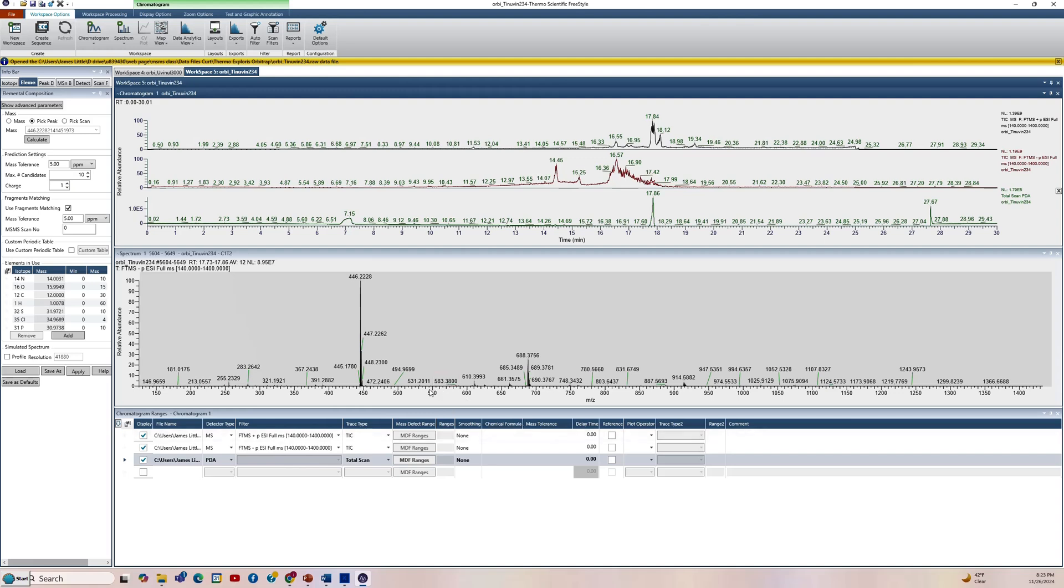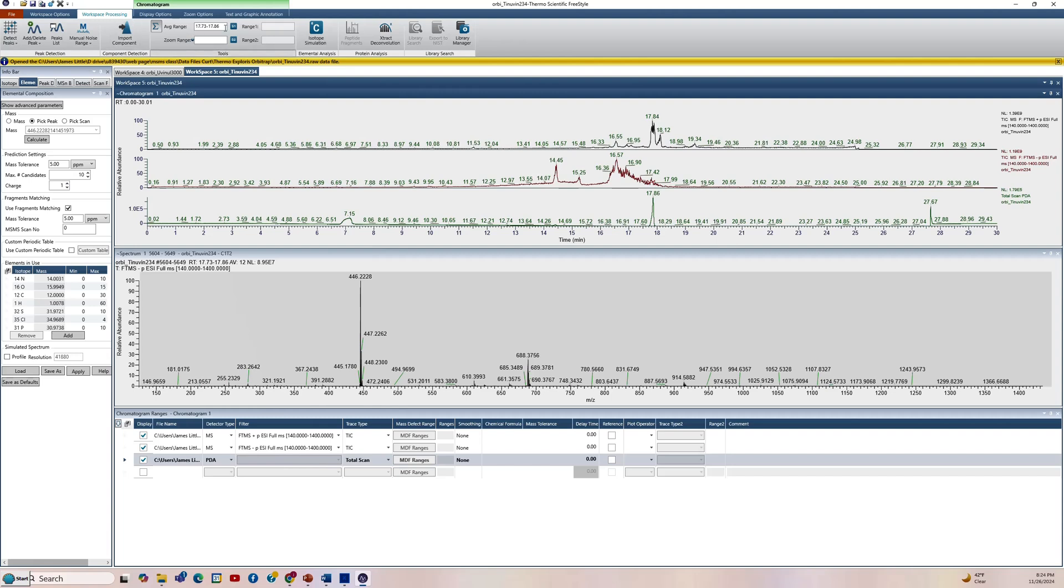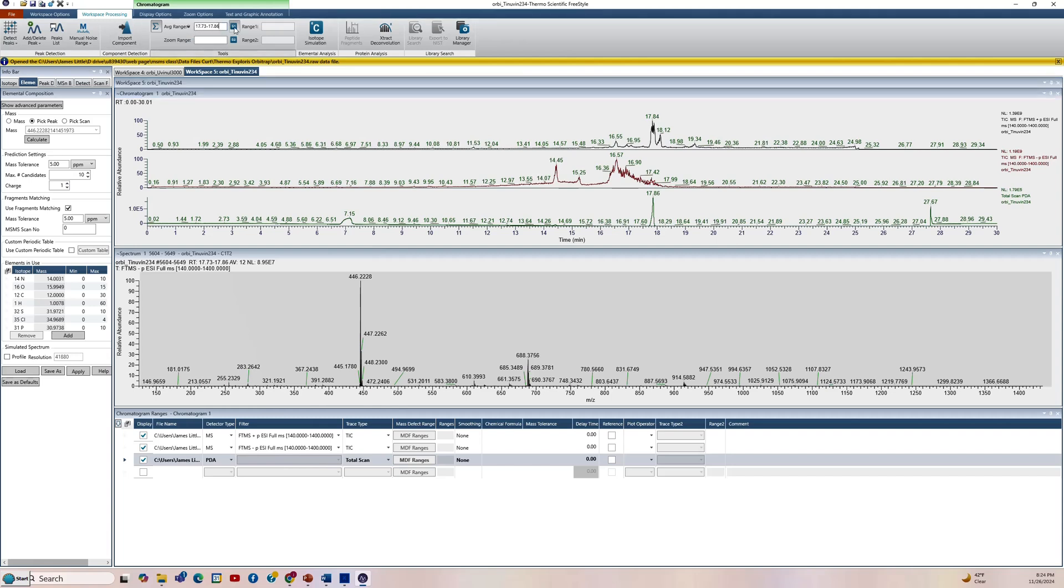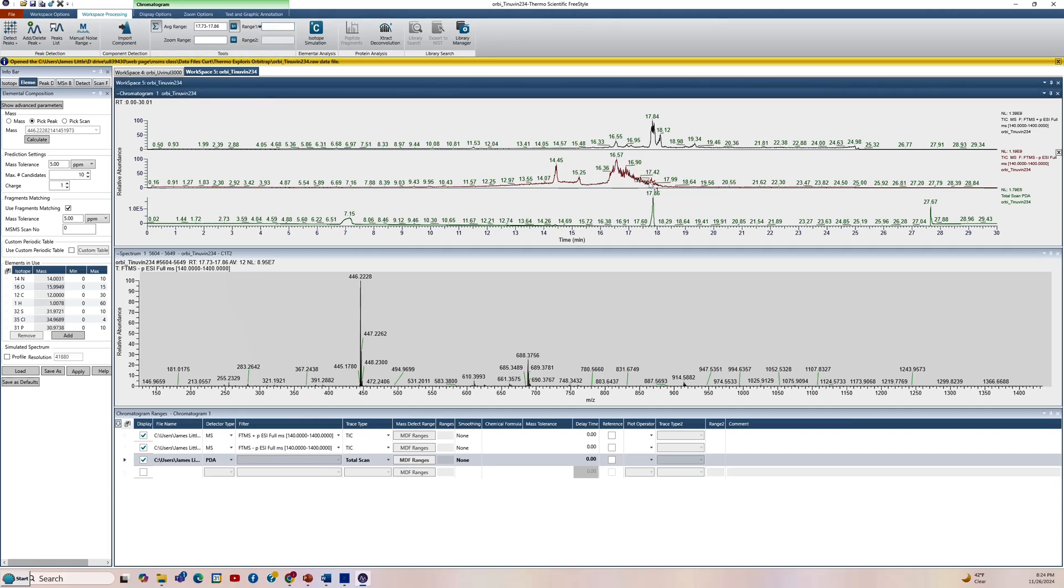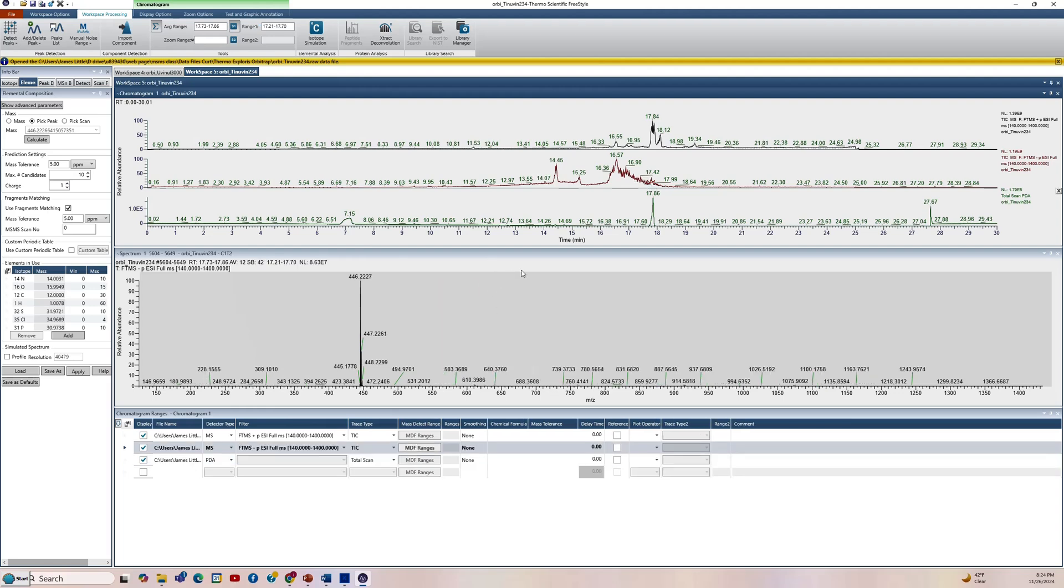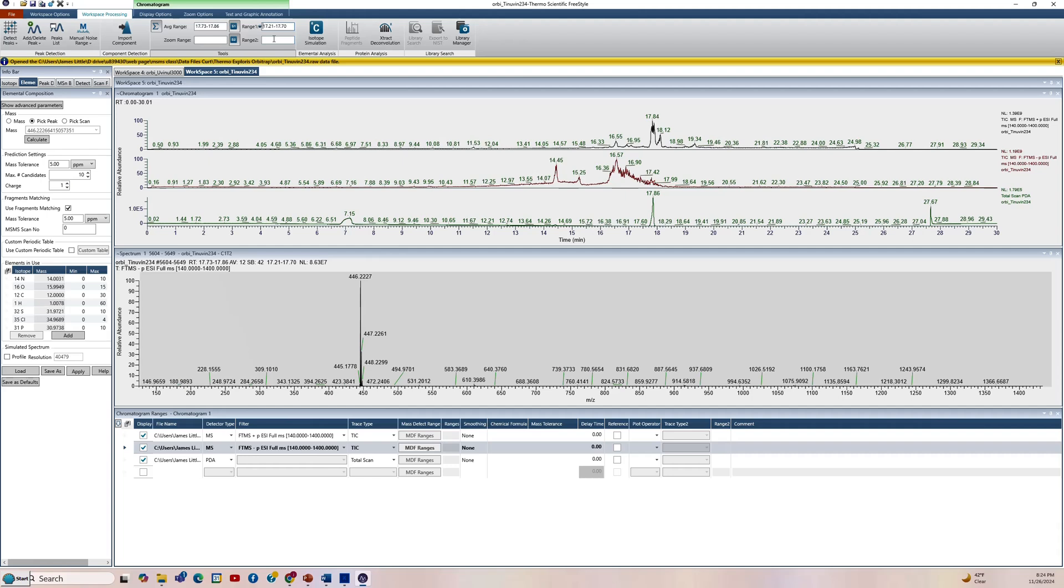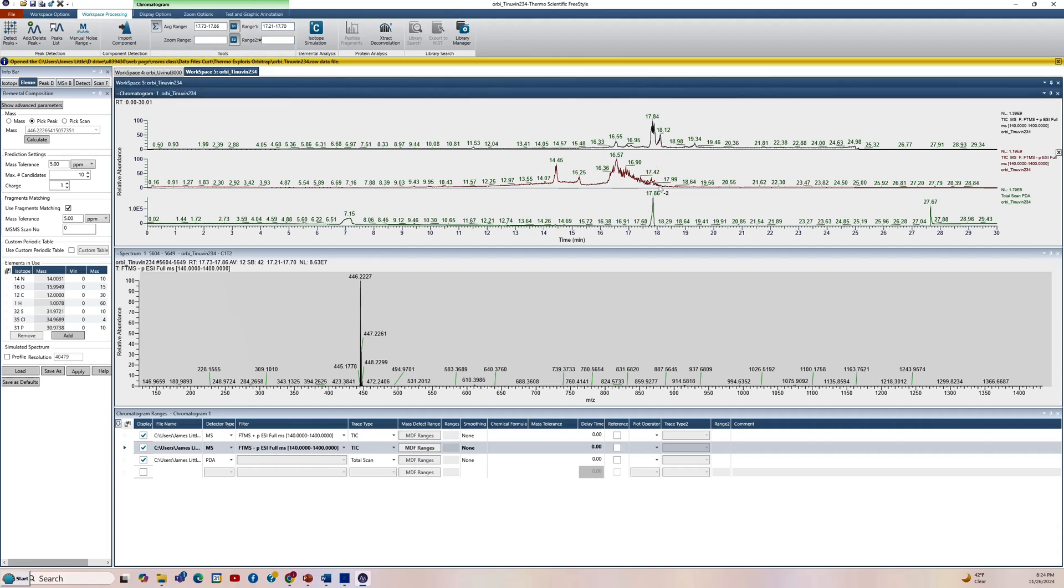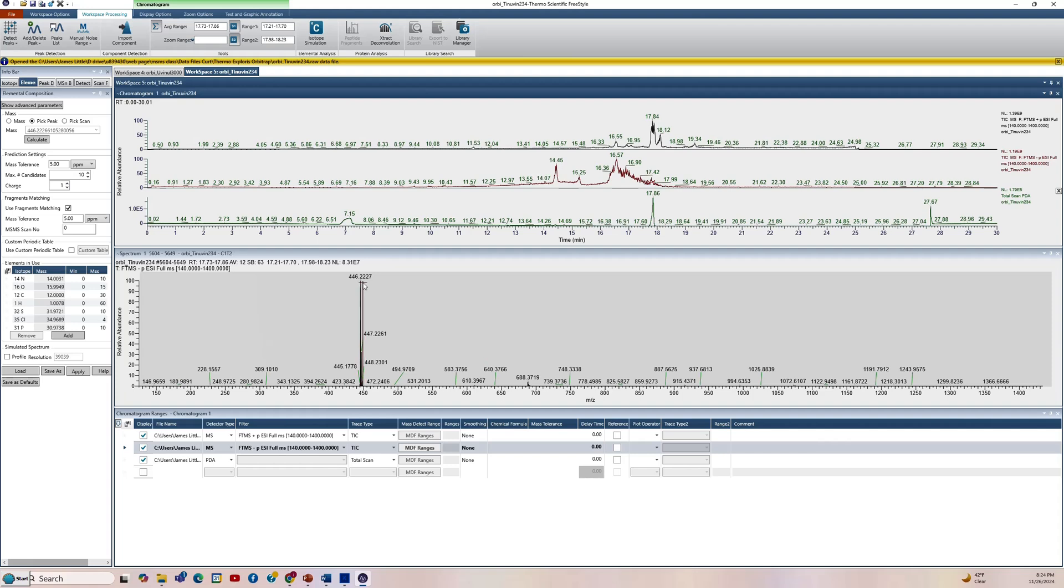We do have a lot of chemical noise here. So if you wanted to clean up the spectrum a little bit, there is background subtracting that you only use in the MS mode. Not the MS-MS mode, but the MS mode. So you can go to the top here. We've already averaged it here. We go to the top here. We can see that the average for the signal is already in the box here. If we want to take some background before it, we click on the S1. Make sure you click on the white box here to get this selected. Then come down. And as you click and drag, you can see what it's averaging out. So it took out a lot of the chemical noise in front. Let's do one in back too. It's not as much chemical noise in the back, but we'll just do one. So again, left click in the box, come to the negative ion, left click and drag. And now we got rid of a lot of the chemical noise and we have the 446.